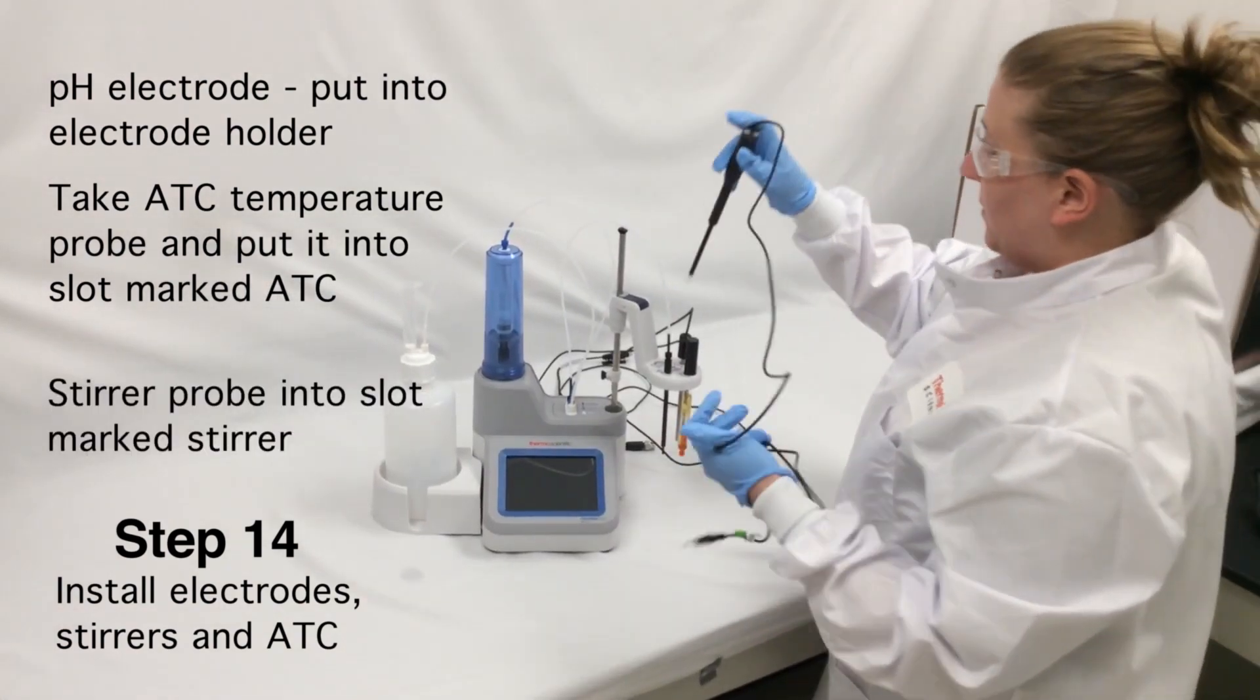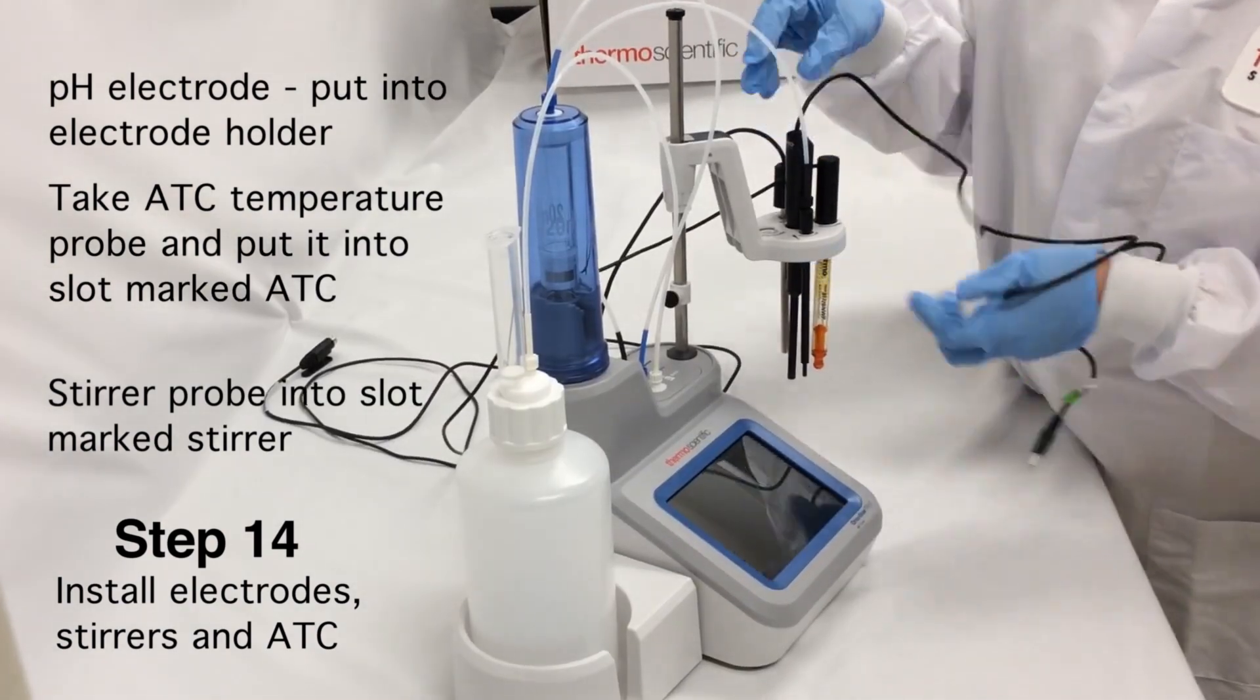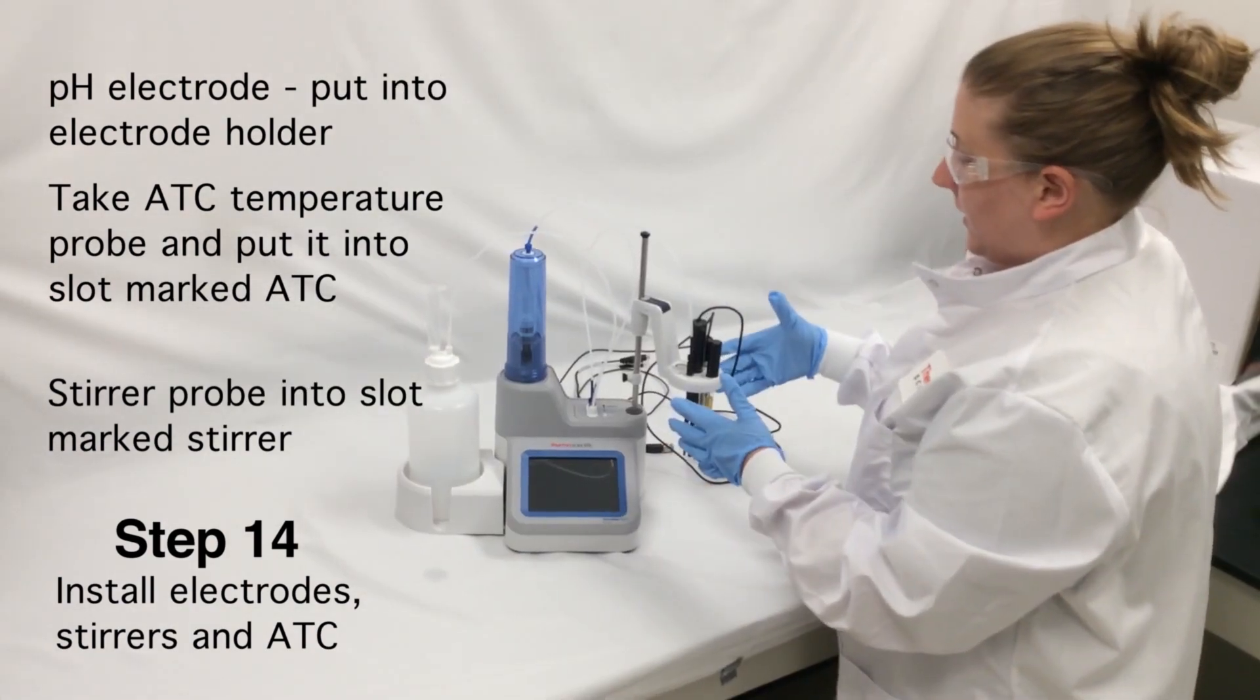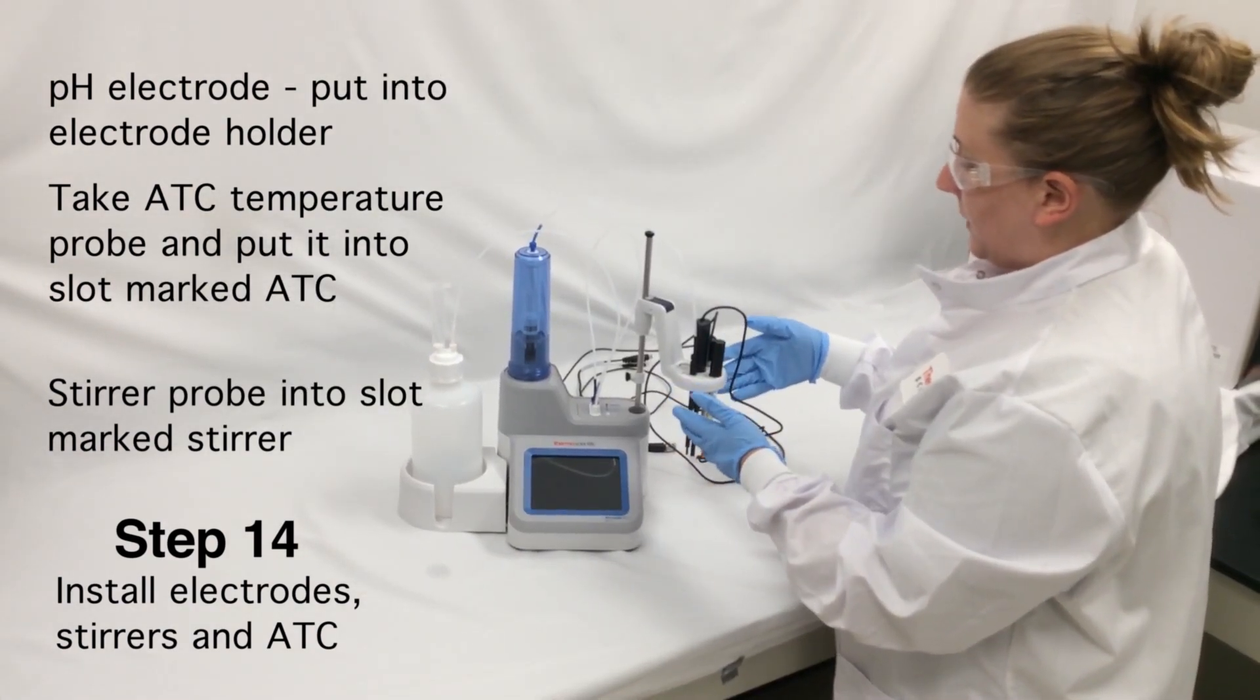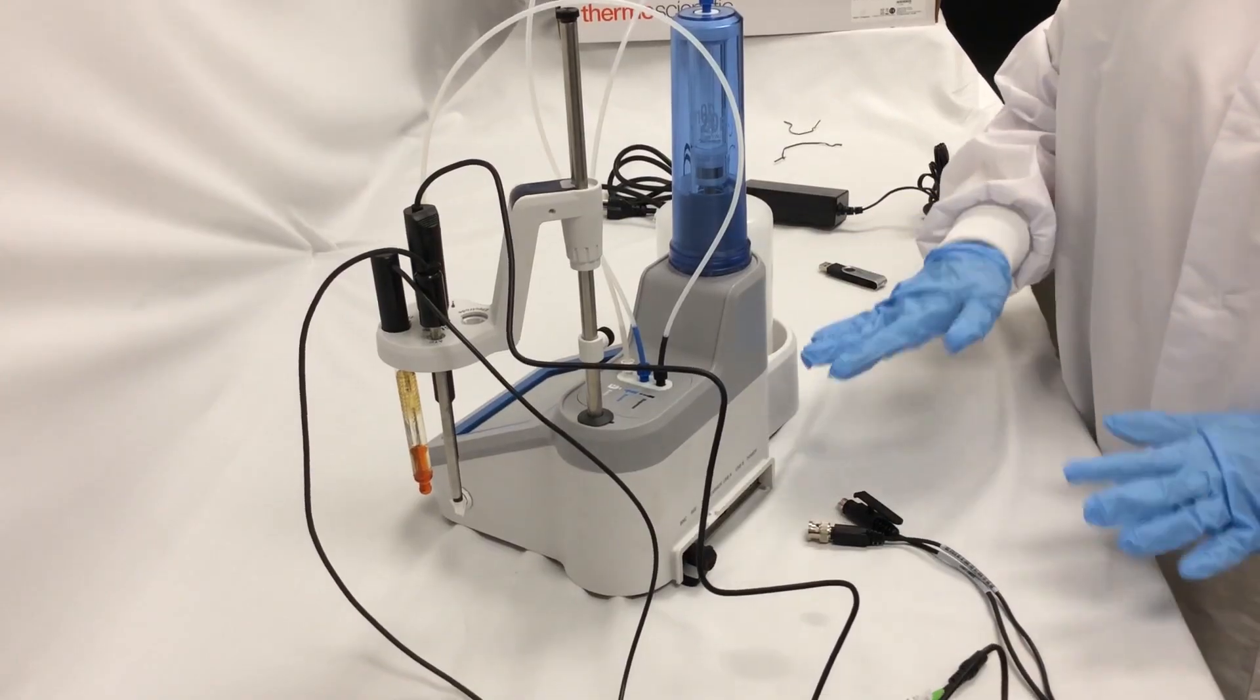Take the stir probe and put it in the slot marked stir. Now all the sensing electrodes, stir, and dispenser are ready to go into the sample holder.